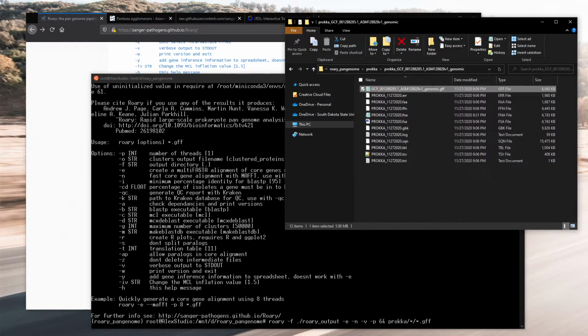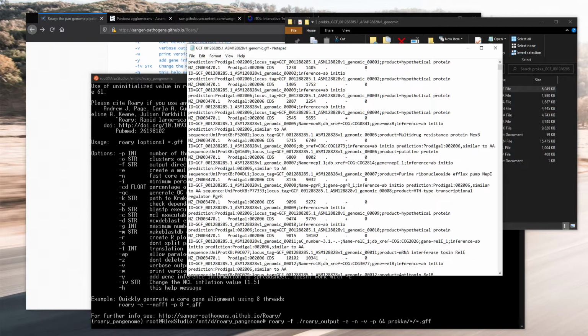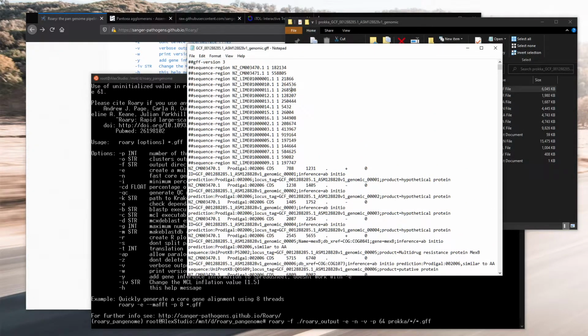Like this guy. Let's see if I open this up. Oh, it's a big file. Yeah, so this is the GFF file. GFF version 3.